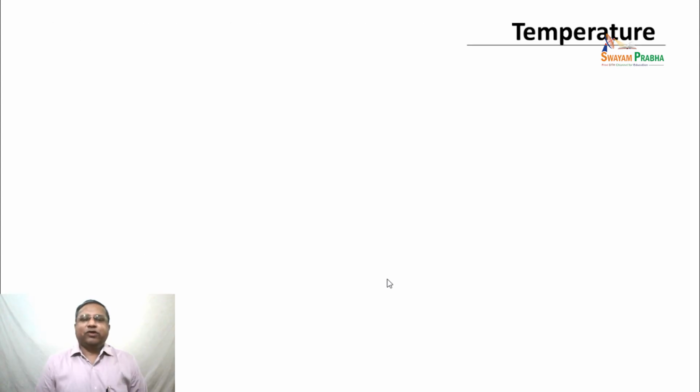Let us first look at temperature. It's common knowledge that there is some kind of an optimum temperature at which the cells work well.